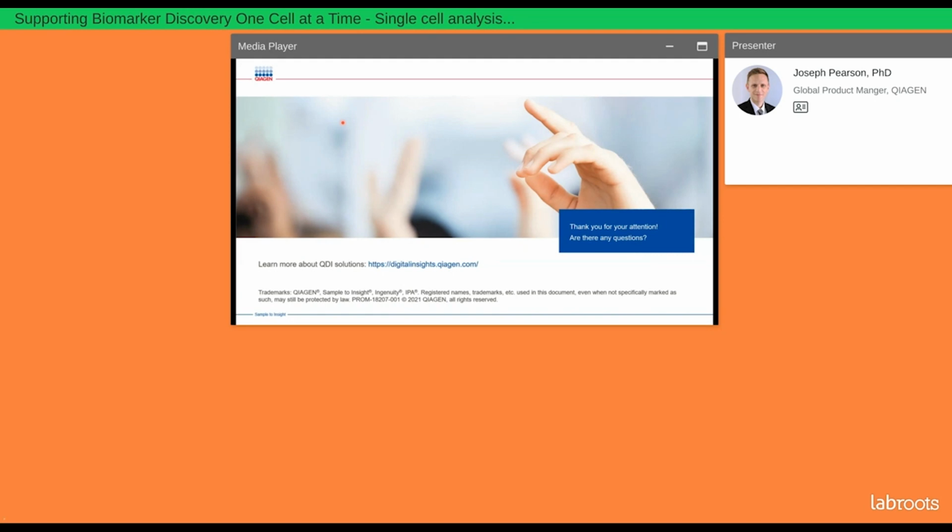Gotcha. All right, great. And can users of the single-cell LANs framework gain access to the raw or underlying data, either project by project or through a data dump or API? Yes, absolutely. So one of the key features that we have is the ability to explore the database and use this as the starting point, the hub for discovering data sets.